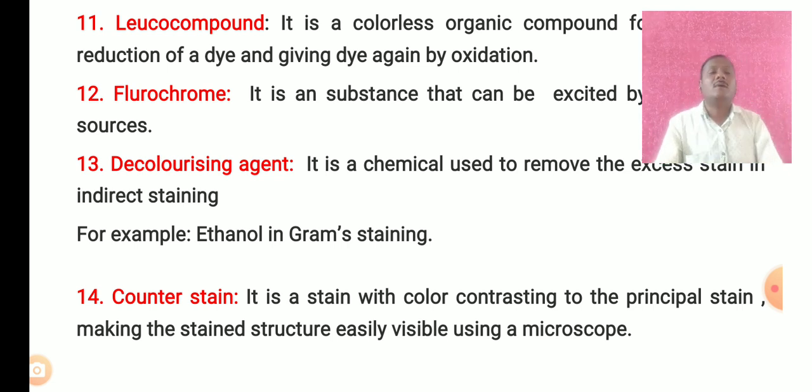And the last definition of these stains or staining techniques is the counter stain. Counter stain is a very important stain because it stains with a color contrasting to the principal stain, making the stained structures easily visible using a microscope. Why is the counter stain used?